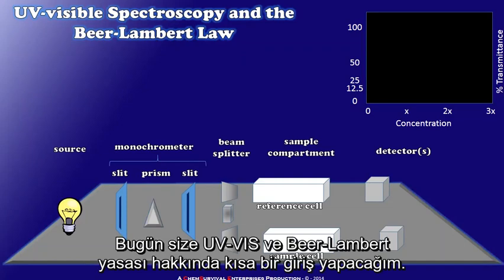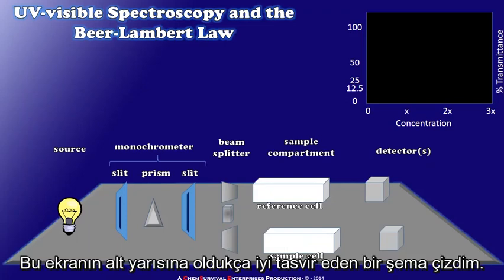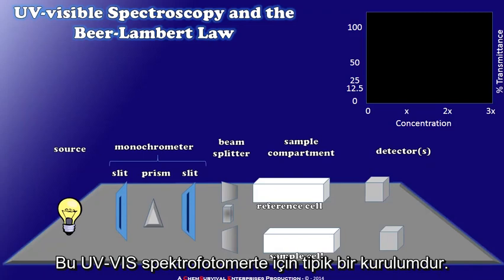And today I'm going to give you a brief introduction to UV visible spectroscopy and the Beer-Lambert law. To begin our discussion, I've drawn a schematic on the bottom half of this screen depicting a fairly typical setup for a UV visible spectrophotometer.